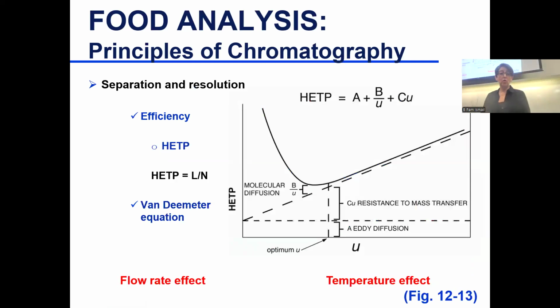All right, so height equivalent of a theoretical plate. Bear with me. We go this way. So what you see here, you see A, that's gonna call it eddy diffusion. B, longitudinal diffusion.